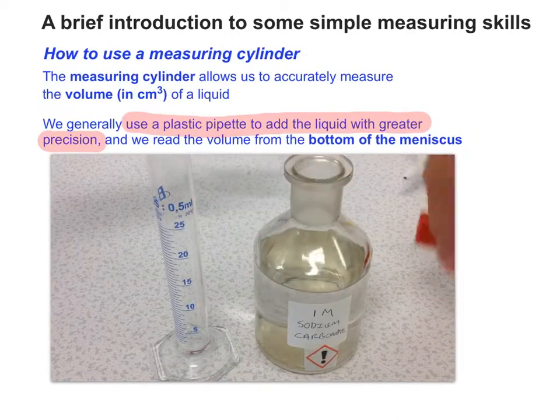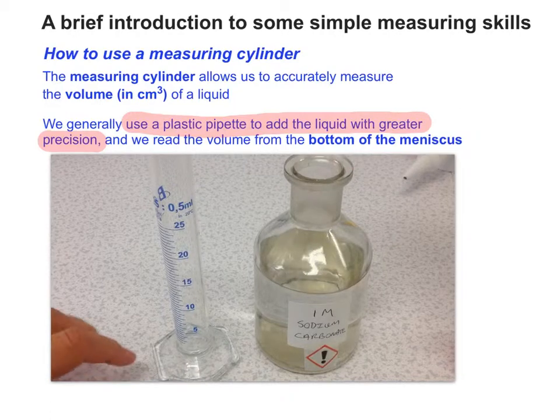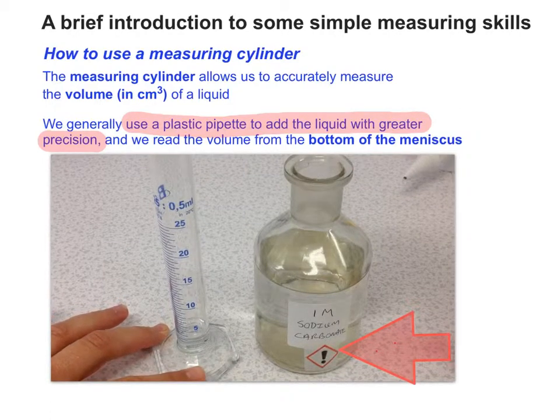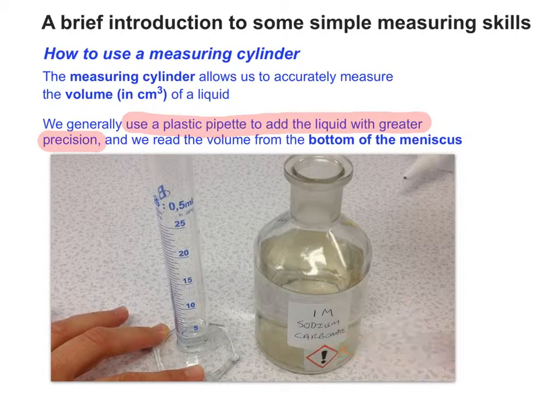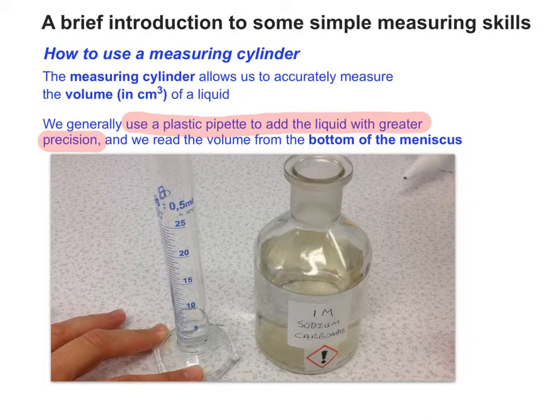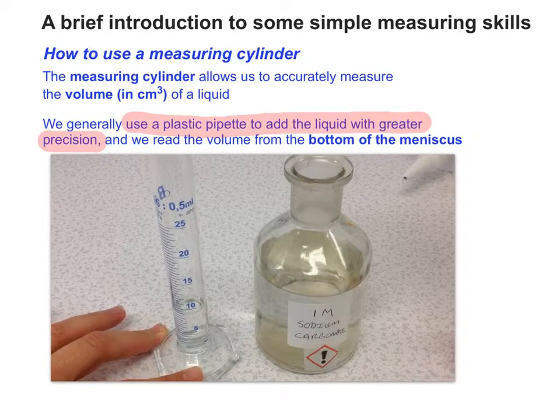I'm going to measure out 10 cubic centimetres of sodium carbonate solution. We can see the hazard symbol on the bottle, so it's much safer if you use a dropping pipette, a plastic pipette. It'll take several squirts to get up to your 10 cubic centimetres, and towards the end you need to add it drop-wise.